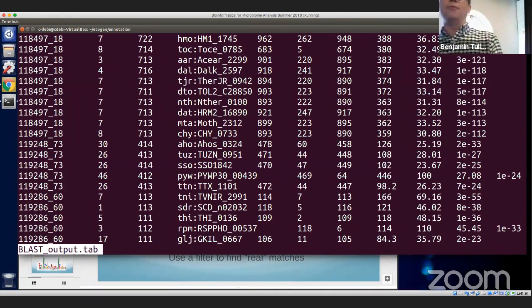The idea is that this tab format is not for you. The visual format that we looked at was for everybody, so we could see what the alignments look like. This tab format is for the computer. Instead of what we had originally, this really intricate output with equal signs and names and lines, where sometimes you had a hit and sometimes you didn't, and there's all this text, now all we have is a brief summary of the results. On the next slide we'll order these based off of match scores, find out the information that way, and then figure out meaning off of that.